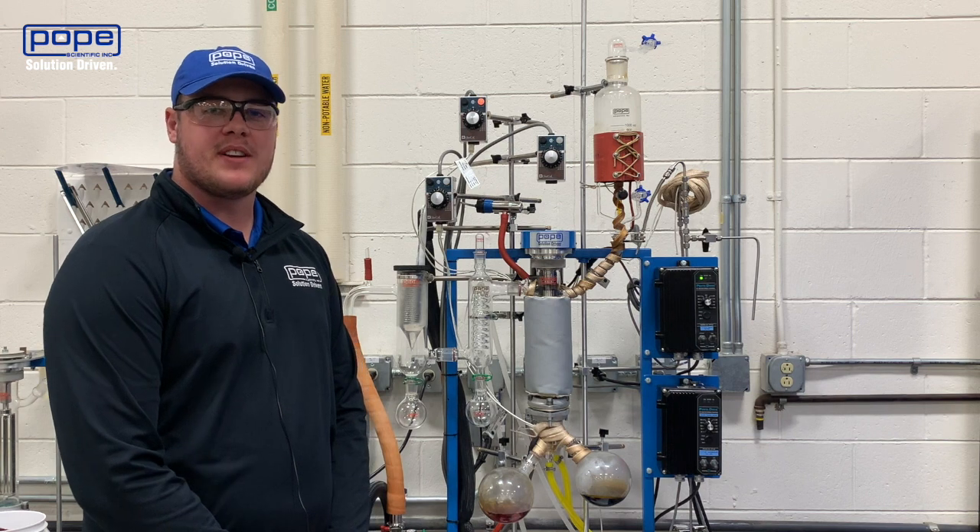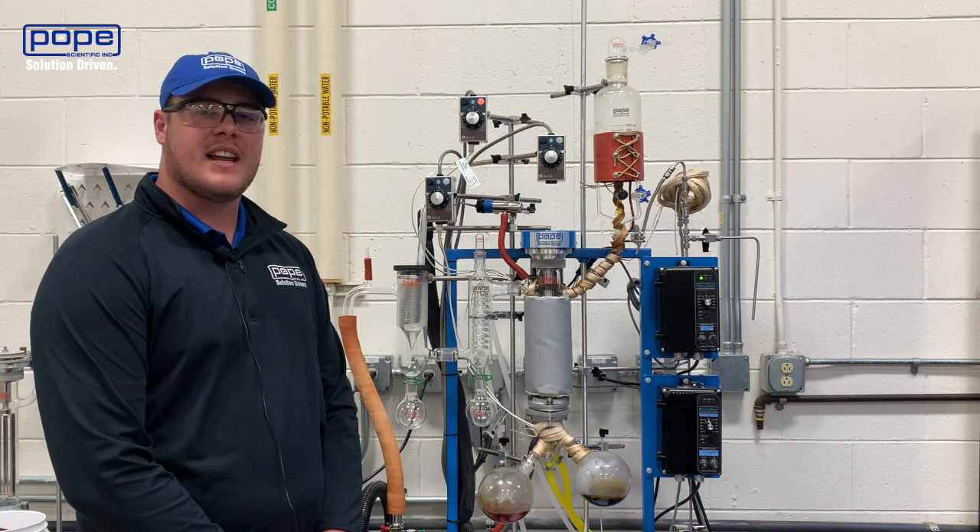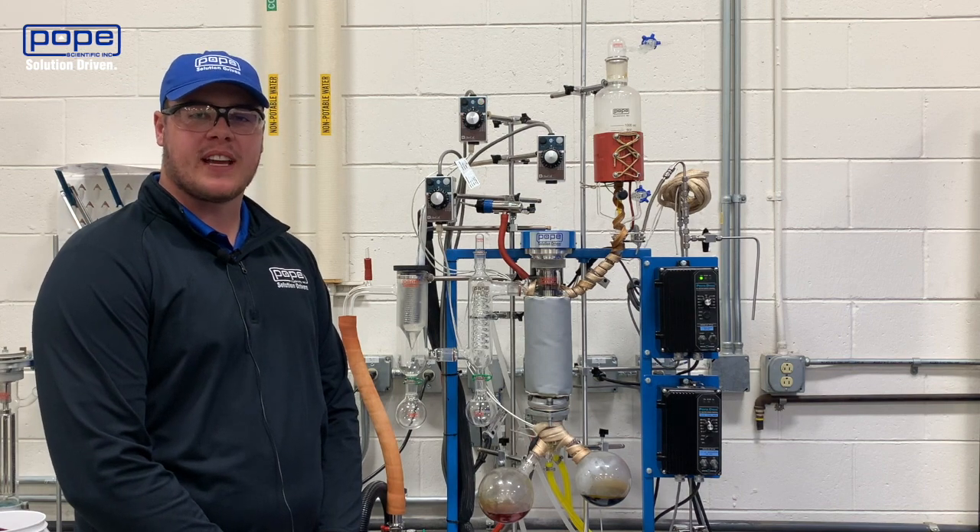If you have any questions about running your first or second pass on your Pope white film molecular still, feel free to reach out to any of us — sales or technical associates — who can help you with that process.